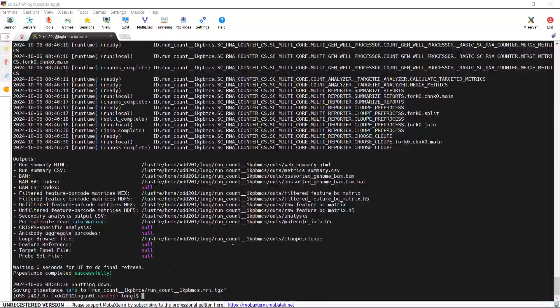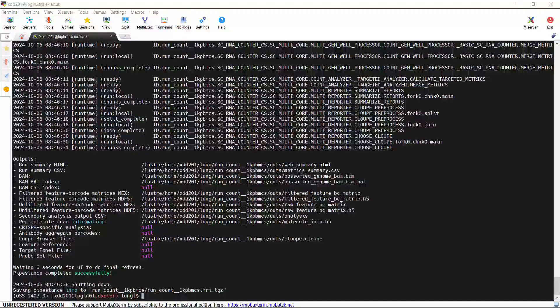Cell Ranger has finished the analysis — it is very quick because this is a demonstration dataset. You can see the output now: we have the summary HTML file, the metrics summary CSV file, and the BAM file, which is the file we can use to create spliced and unspliced mRNA data. Down here we have the filtered feature barcode matrix, the filtered feature barcode matrix in HDF5 format, the raw feature barcode matrix, and the raw feature barcode matrix HDF5 file. There is also an analysis folder and output for viewing the analysis in the Loupe Browser.